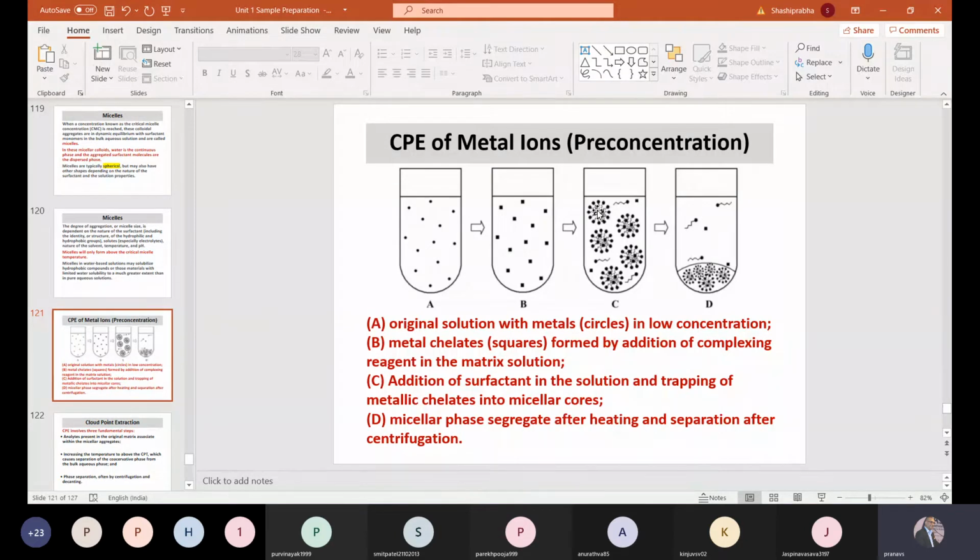तो ऐसा स्ट्रक्चर बन जाएगा, इसके अंदर ये सब चीजें चली जाएंगी, ये जो कीलेट्स हैं वो इसके अंदर बैठ जाएंगे। बैठ गए अंदर, उसके बाद तुम इसको हीट करो। जब हीट करके ठंडा करोगे तो तुम देखोगे, और सेंट्रीफ्यूज भी कर सकते हैं, you can find a distinct phase which is known as the surfactant phase, जिसमें सारे extracted analytes अंदर आ चुके होंगे.